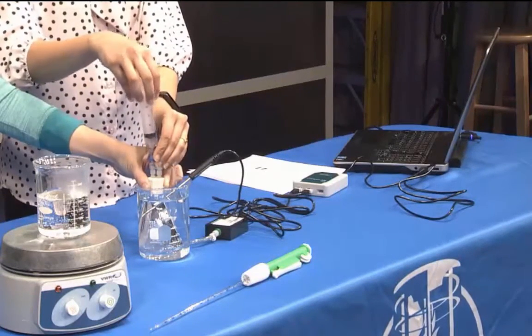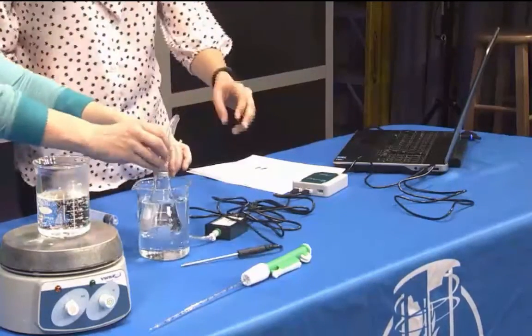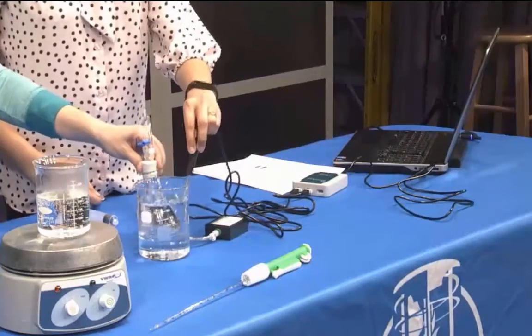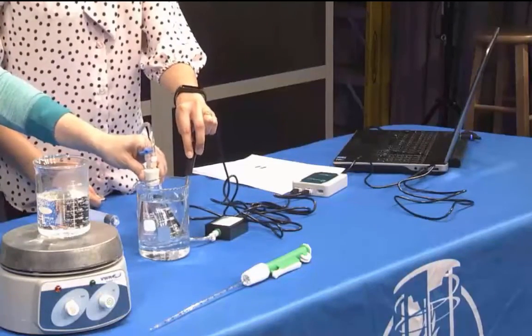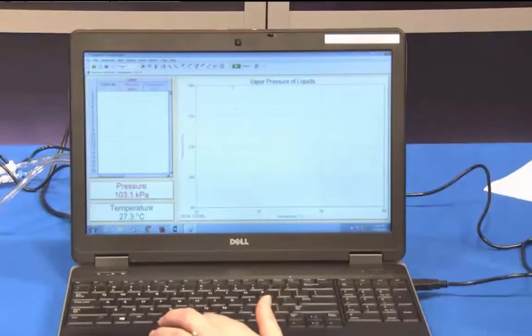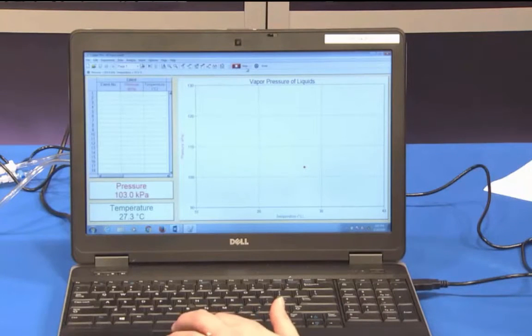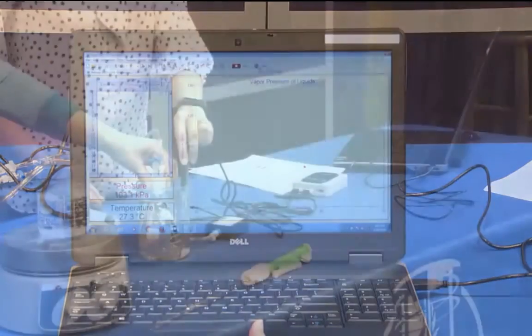Gently rotate the flask in the water bath for a few seconds using a motion similar to slowly stirring a cup of coffee or tea to accelerate the evaporation of ethanol. Monitor and collect the temperature and pressure data by clicking Collect to begin data collection. Make sure the person is holding the flask steady once again and monitor pressure and temperature readings. When the readings stabilize, click Keep. Record the pressure reading as P total and the temperature readings in your data table.